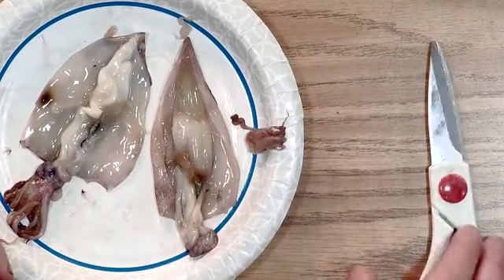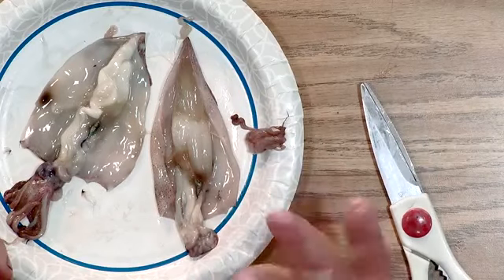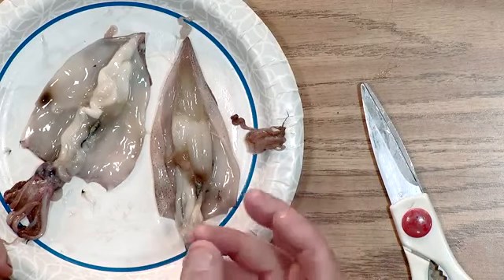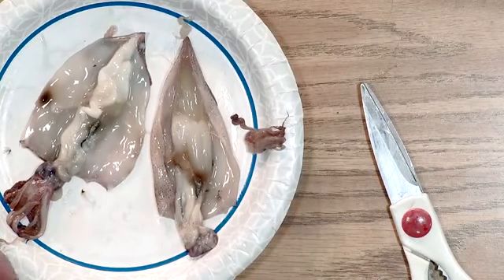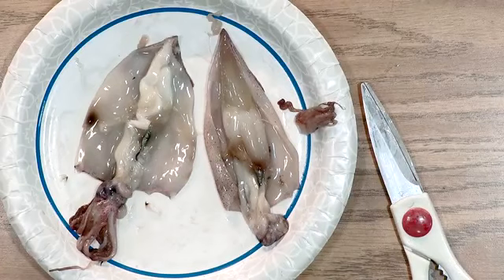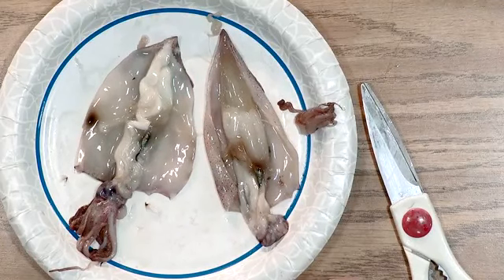All right. So here you've got, on one side, down here at the tip, a very clear, kind of murky area, and then this is way more milky on this side. Totally different. So we've got this great side-by-side comparison of a male and female squid. Which one do you think is which?